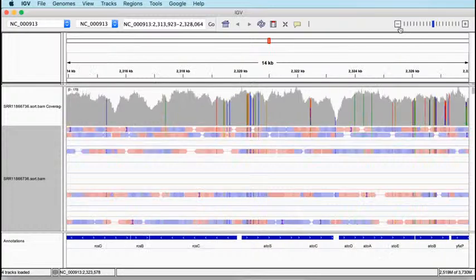In a stranded experiment, all of the fragments which align to a particular gene should align with the first in pair read on the same strand.